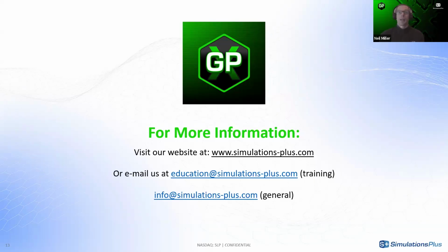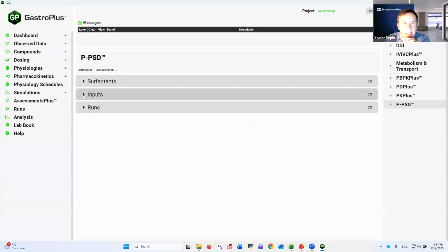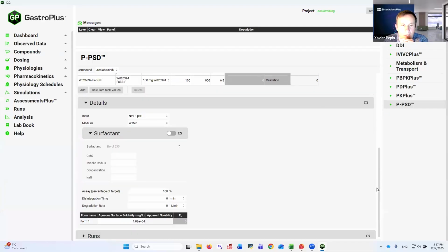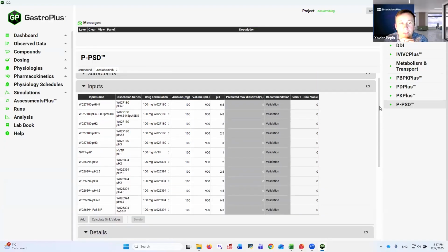But we've had some questions today about the PPSD. The first one I think you've partially answered, but we'll circle back to it. It's how do you optimize the number of bins in the PPSD approach? Yes, that's an excellent question. Ideally, and I can go back to the PPSD module, ideally, you would want to minimize it to well represent your dissolution without adding too many bins. So it's really a question of where do you stop?